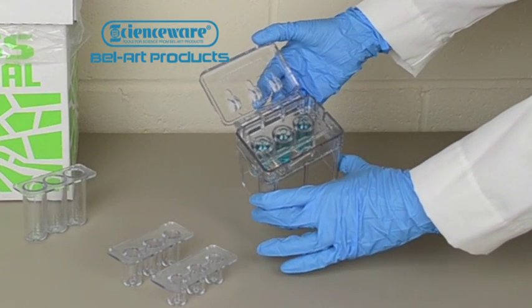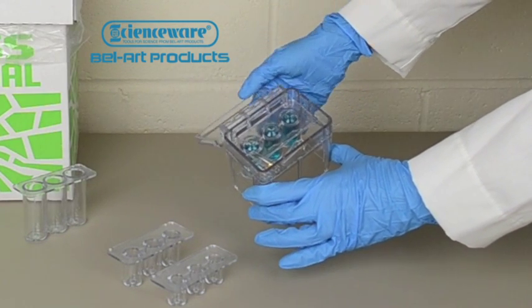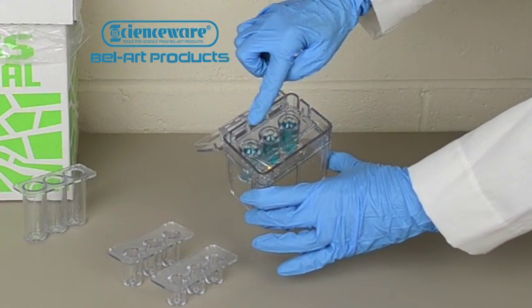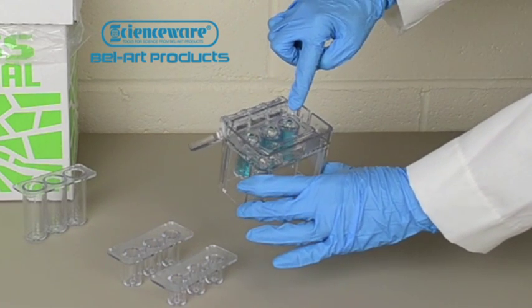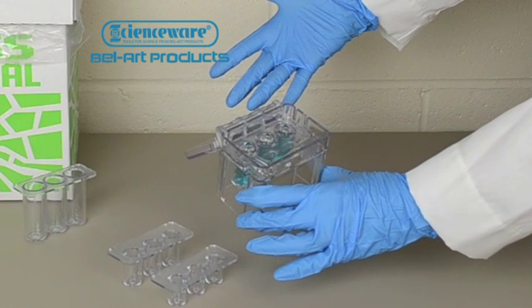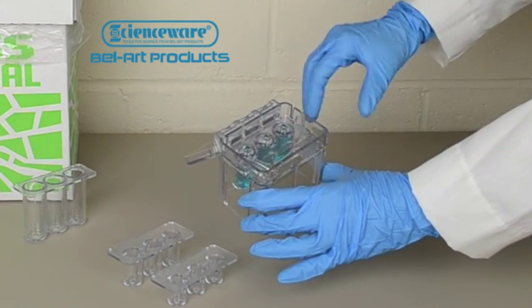The unique box style design will contain all glass pieces within the box and the ampule bodies will stay securely upright, preventing the contents from spilling. Even better, fingers stay away from sharp edges, eliminating the risk of injury.